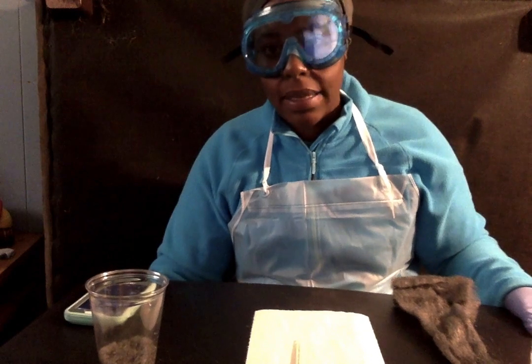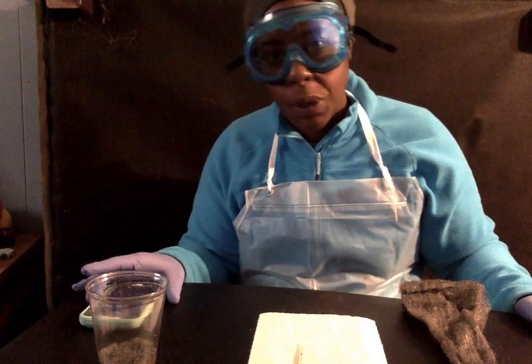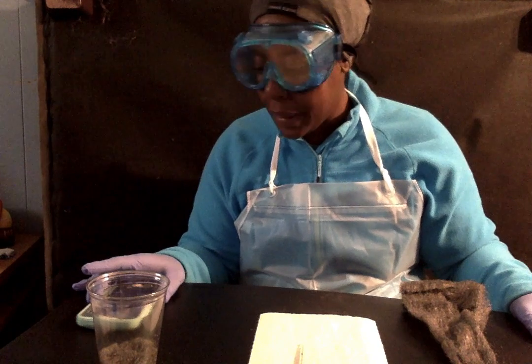So you want to be sure and do that. As I'm just thinking about it, one of the mishaps is that if you notice, I didn't have my timer out and ready. So not sure if it's more or less than 2 minutes, if it'll make a big difference, but that's something to be mindful of if you are going to repeat this experiment.